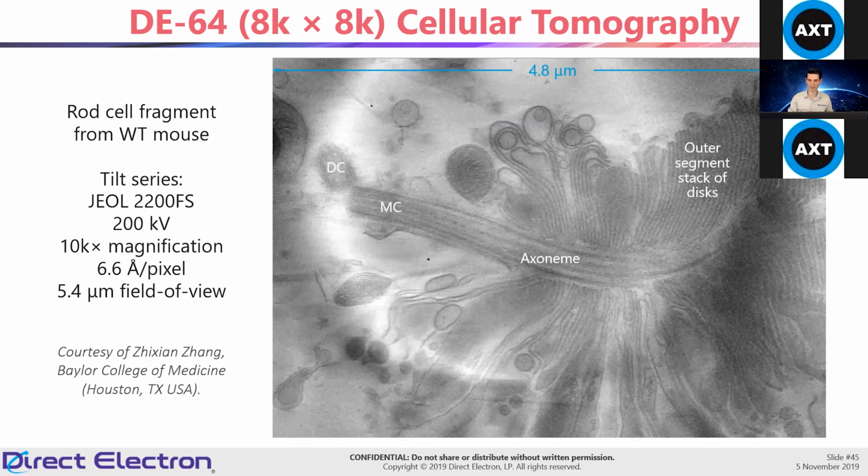So we can see they add up a couple of frames, and it looks quite nice for the reconstruction. And you can see all the segments in it.